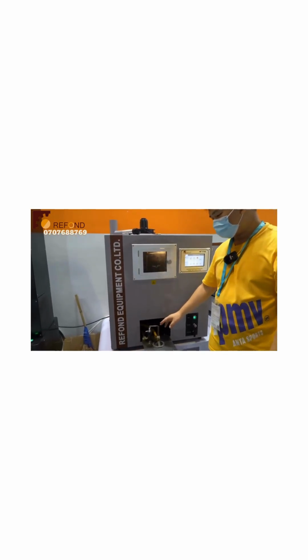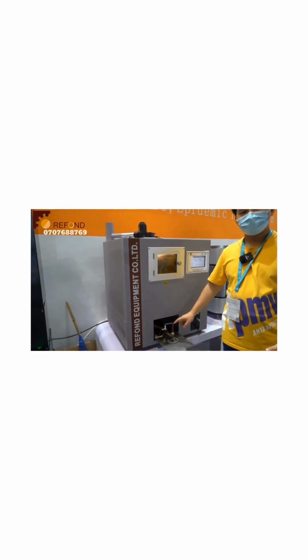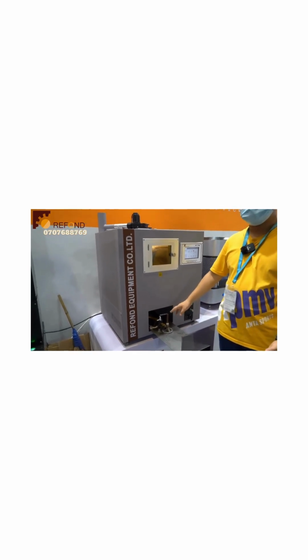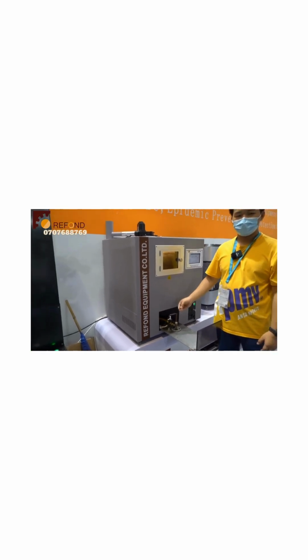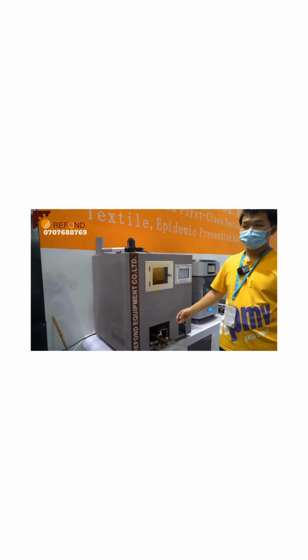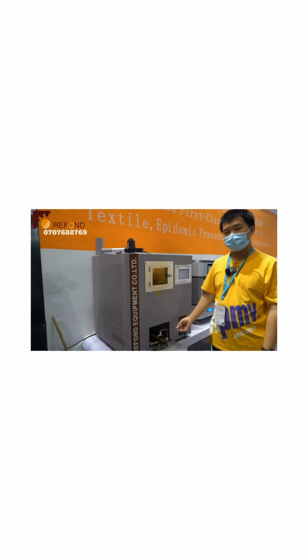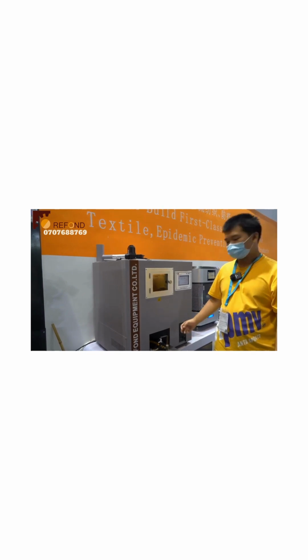For this test, one of the most important things is that you need to keep the flame blue. One reason is that the blue flame will produce more nitrogen oxide for the test. And the other reason is that if the flame is not blue, that means the gas, the fuel, is not burned completely. In that state, the flame will produce carbon monoxide and also some dust, which is very dangerous. And if the carbon monoxide and the dust come in contact with fresh air, it may cause an explosion.